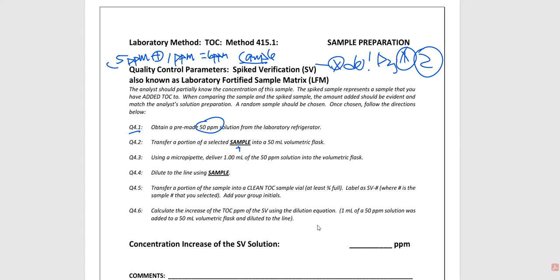So volume is very important. So samples are going to be used. You keep your hands off of the DI water sprayer. That is not what goes on here. No DI water sprayer, no DI water faucet, nothing. No. It is sample. Have I made that point clear?